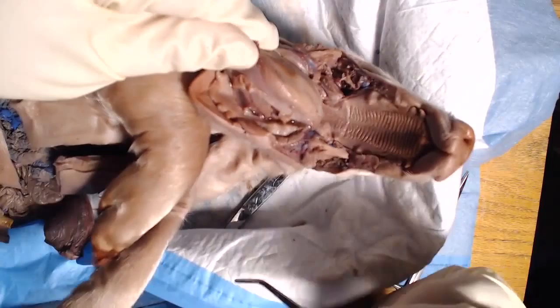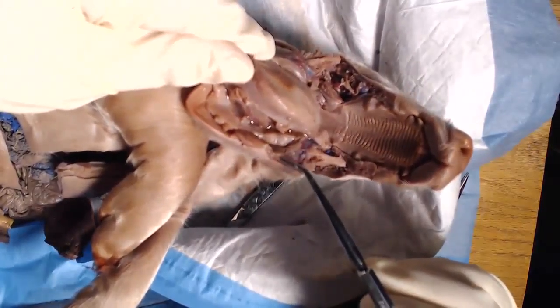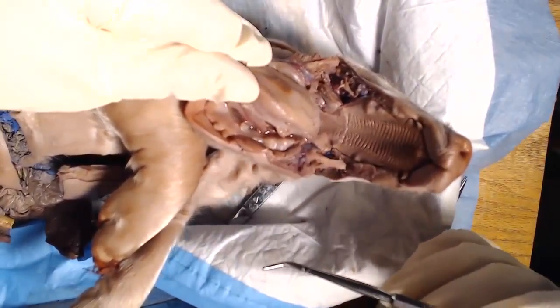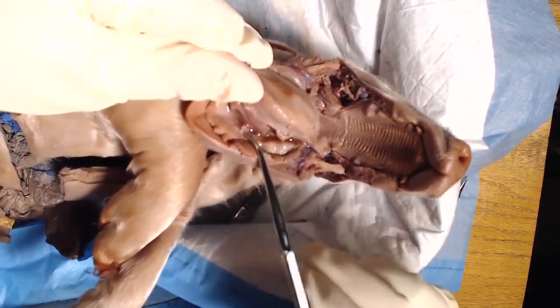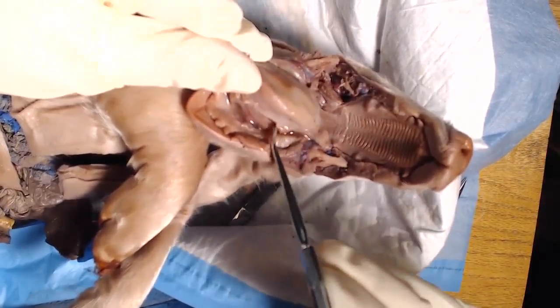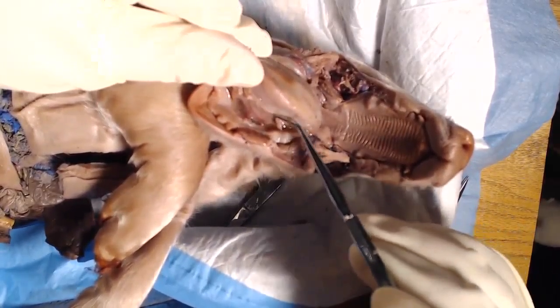It's kind of similar to the parotid in that it's a very thin gland, kind of flat, doesn't have a great solid structure like the submandibular, but it's still pretty easily identifiable right here where we cut it. So you should be able to see that glandular tissue right underneath the tongue.